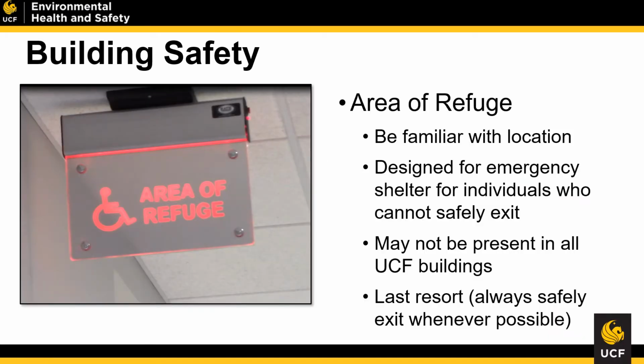In newer buildings, an area of refuge may be present. An area of refuge is a specific area that is designed to be the most structurally sound spot of the building. So, in the event of a fire or some type of structural failure to the building, this area is the area that will last the longest. Not all buildings have an area of refuge, but in the event that a building does have it, it is a good place to huddle because first responders will look here first before searching other areas. So please be advised as to whether or not your building has this unique structure, and if it does, in the event that you cannot safely exit the building, then please use this as your rally point. But I always recommend if you can find a way out of a building, try to use that first.